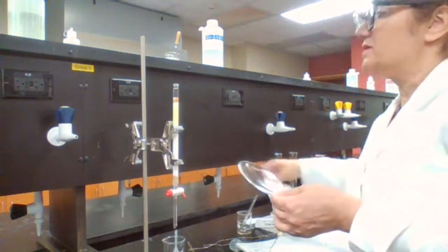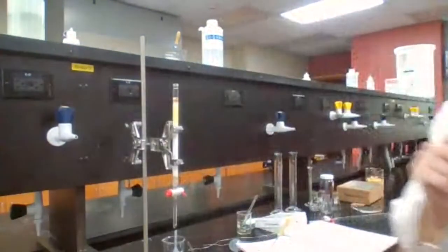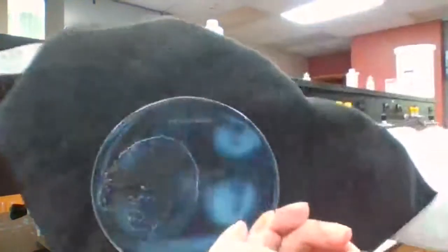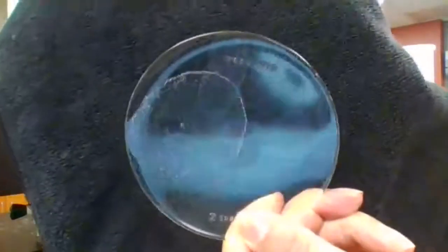A white residue is forming now, but I don't know what background is going to help you to see it. A black background for you. Do you see the white residue on the watch glass now?